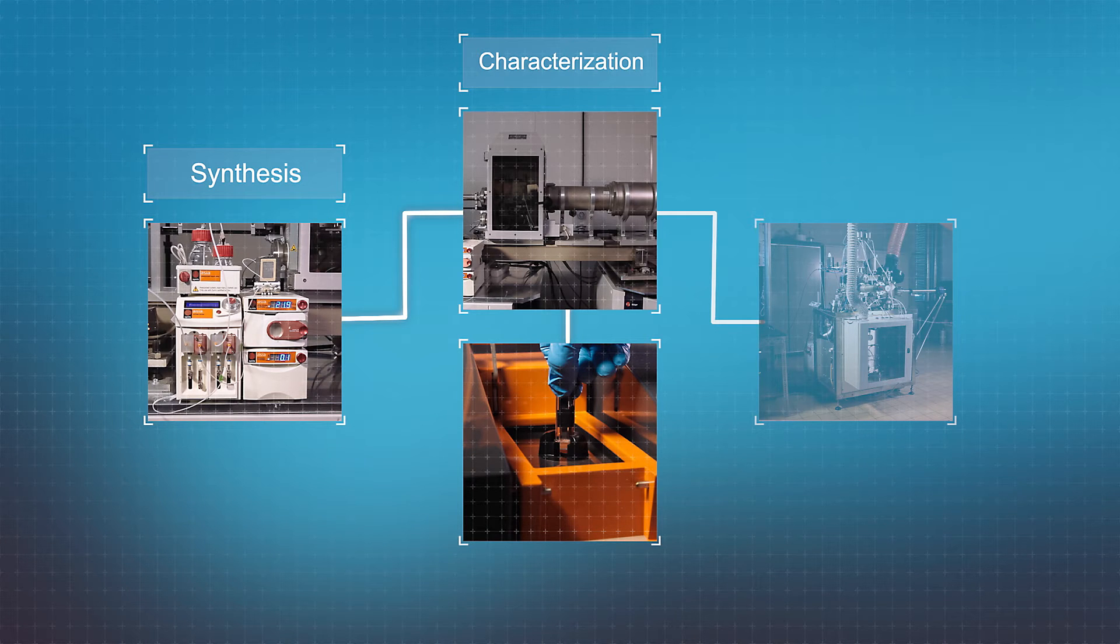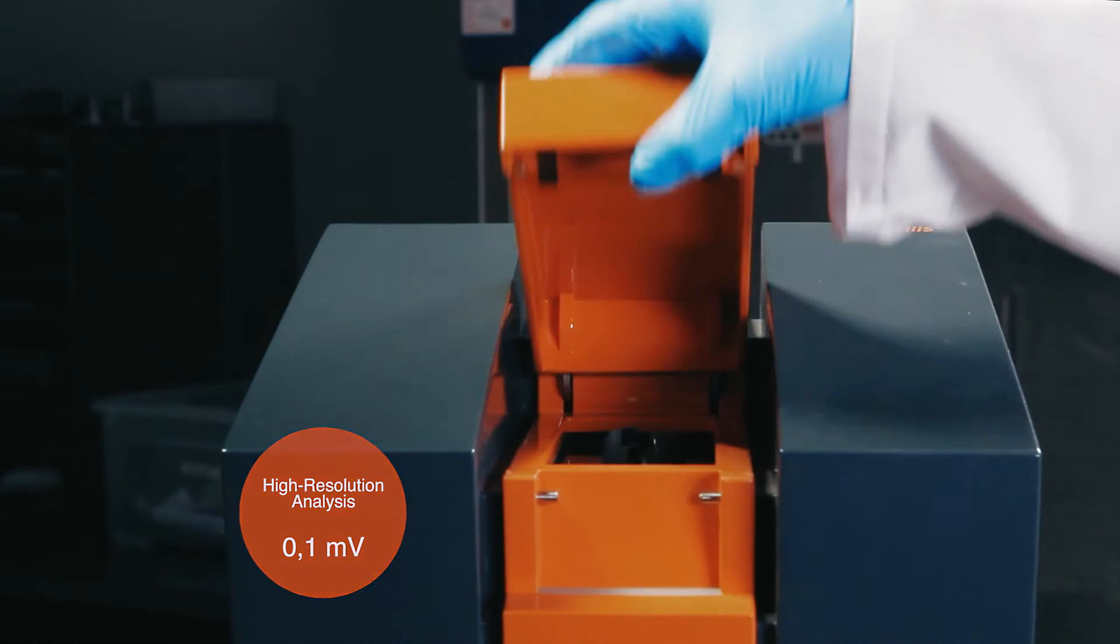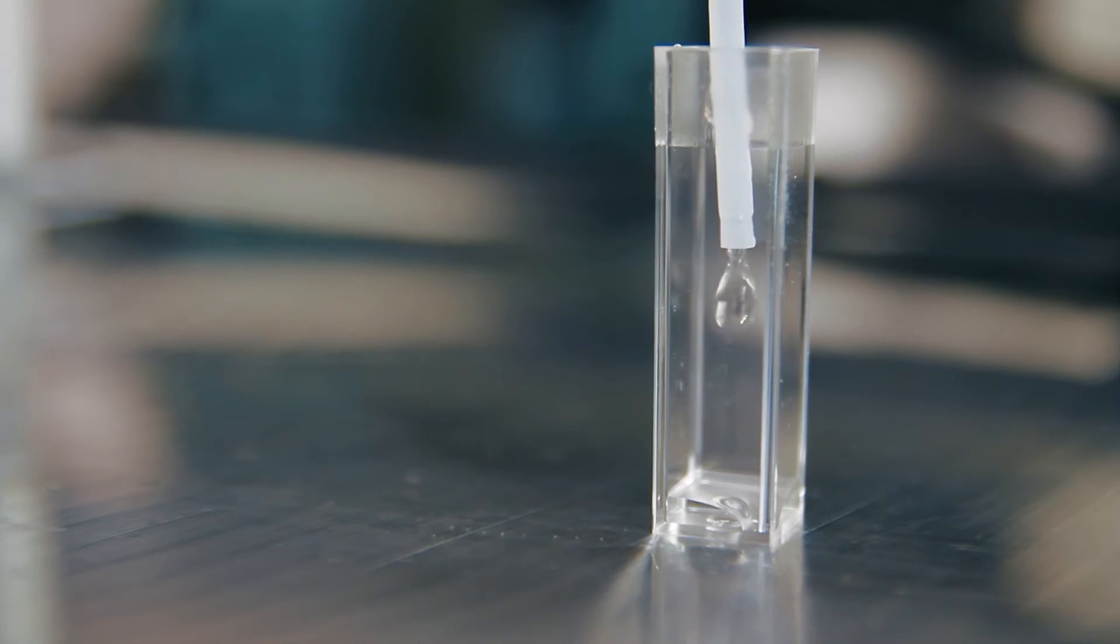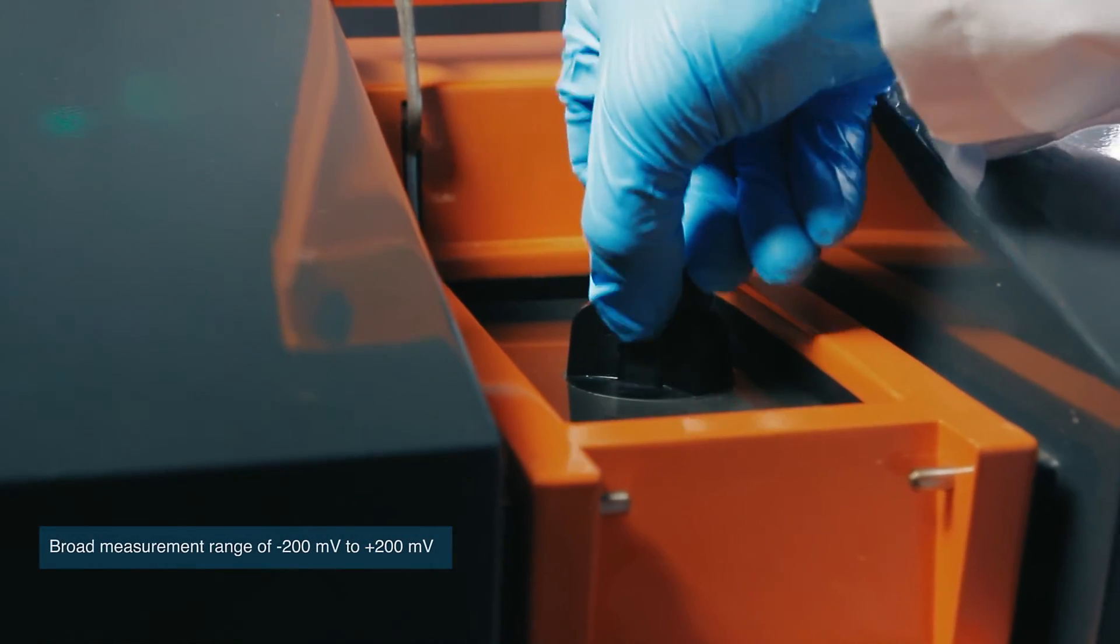High resolution zeta potential measurements are implemented in the production line by using a semi-automated bypass system. This arrangement ensures a fast and easy way to determine the nanoparticle's charge.